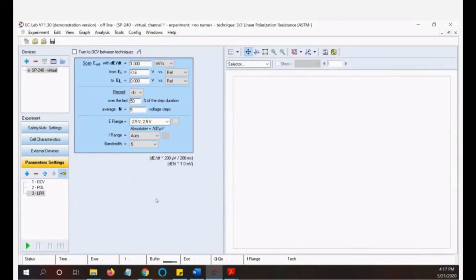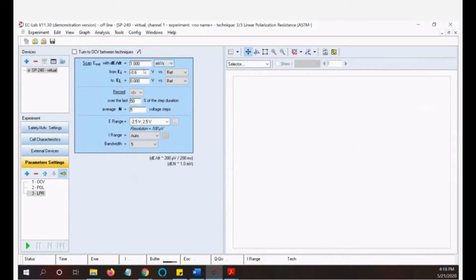Now we move on. It's not that long to run this experiment — we just hit Run and wait until it is done. We have a range of 0.6 volts to zero, which is 600 millivolts, and the scan rate is 1 millivolt per second, so it will take about 600 seconds, or 10 minutes, to finish. Then we load the result.